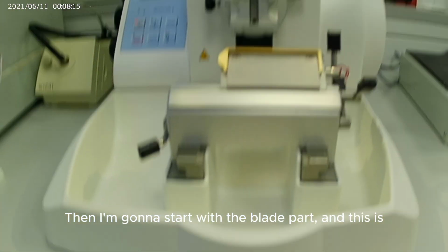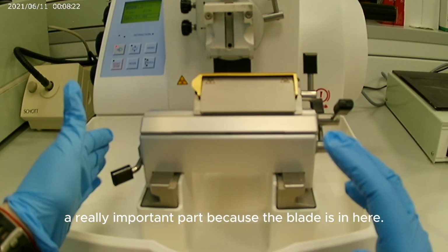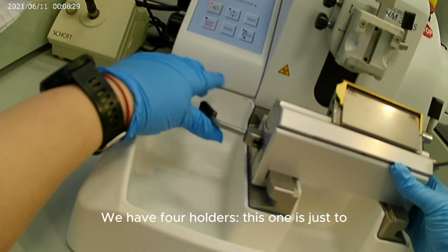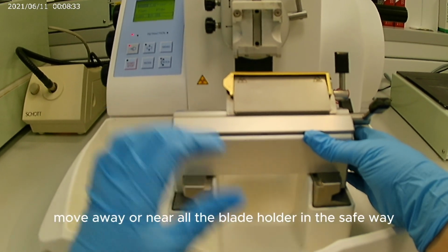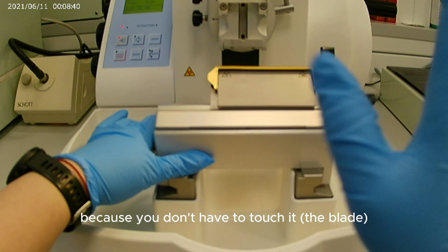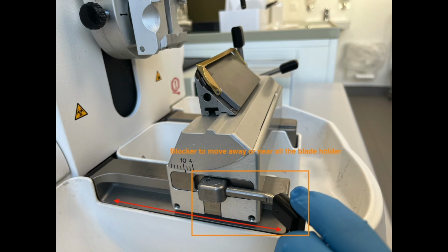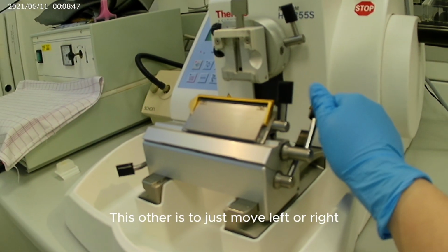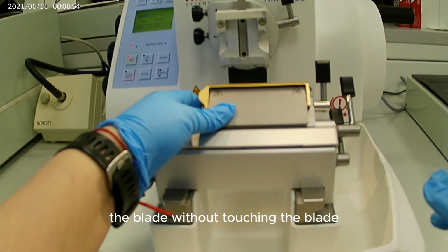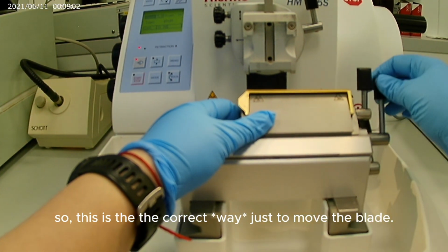Then I'm gonna start with the blade part, and this is a really important part because the blade is in here. We have four holders. This one is just to move the blade holder away or near in the safe way, because you don't have to touch it, and you can also take it out for the cleaning part. This other is to just move the blade left or right without touching the blade. So this is the correct form to move the blade.